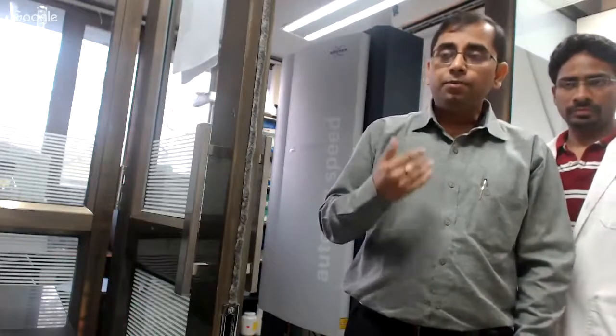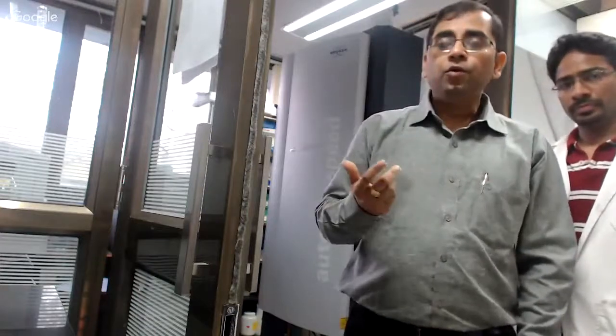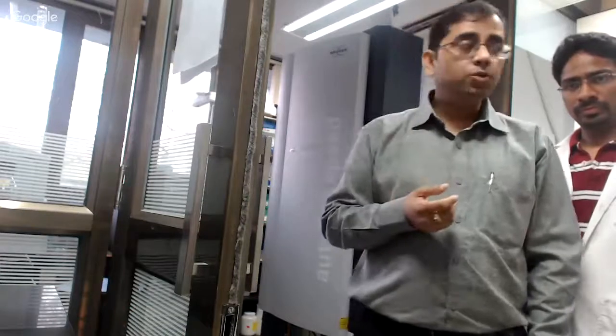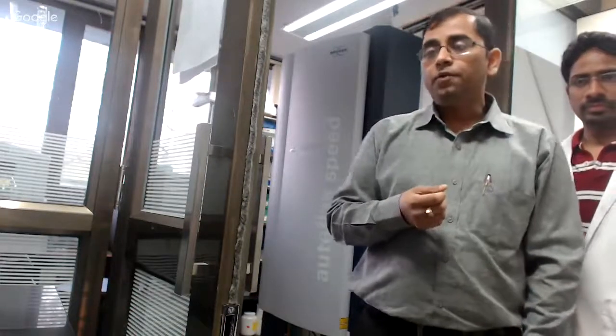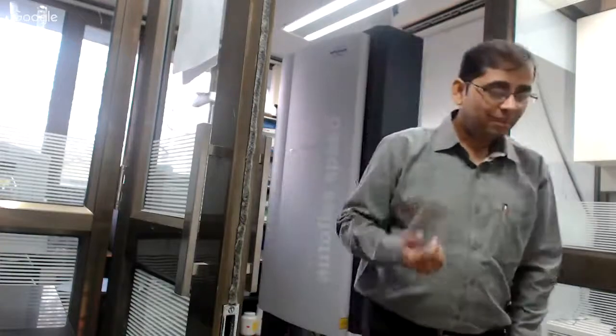Again, in the spirit of helping you become much more comfortable with proteomic technologies and what you can get out of them, we are planning certain hands-on sessions and live demonstrations each week. I'm sure many of you will be able to make good use of them. So please, let me continue the session with Dr. Aishwarya and Vipin, to take you through the actual workflow of doing Maldi TOF based sample analysis, and after that we can take more of your queries and comments. So let me thank you here, and I will hand over to Dr. Aishwarya. Please.